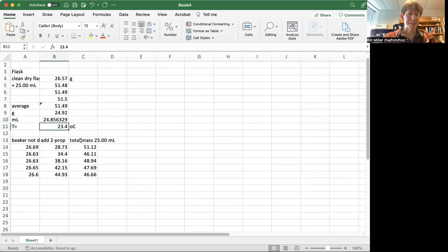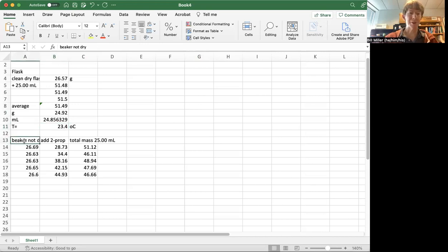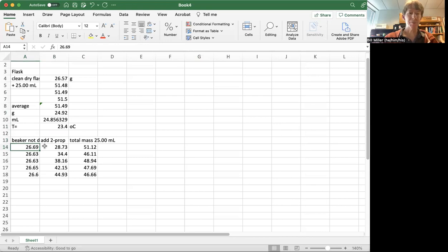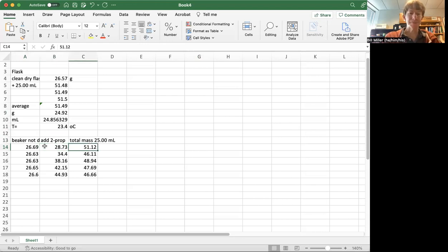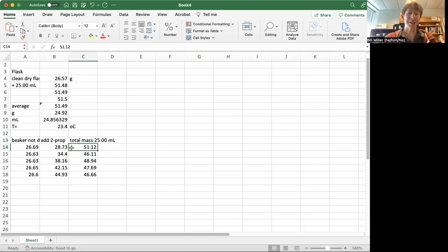So then I went and I made some mixtures. I took my beaker, which was not dry, and then I massed it, recorded its mass, and I added my 2-propanol, then I added my water until I got to 25.00 milliliters.